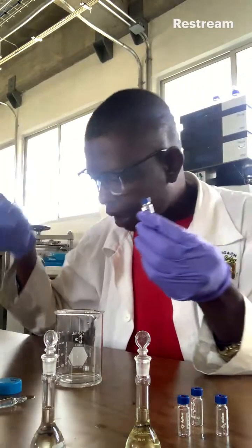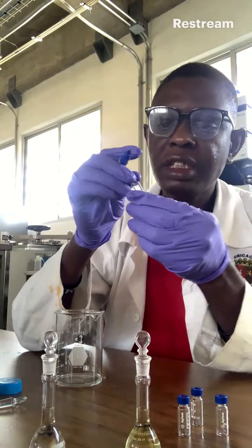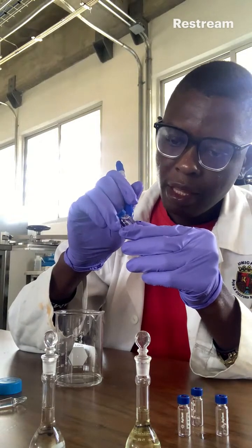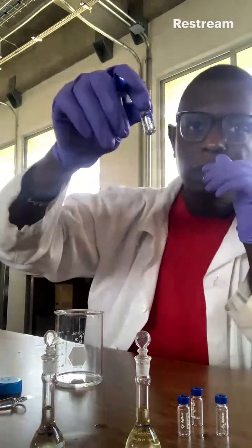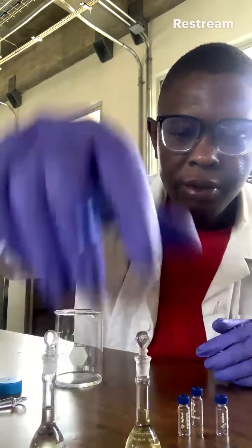So I took from GCNAL. I will name this GCNAL2. All right, so this is my GCNAL2. I'll keep it down.